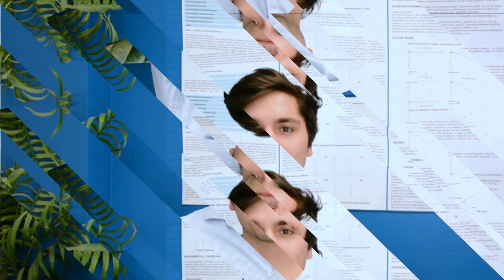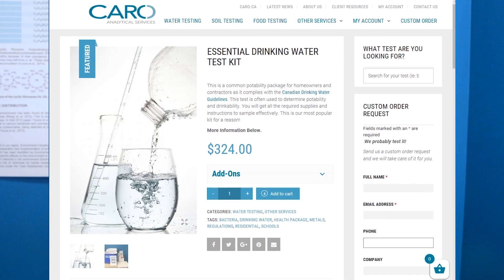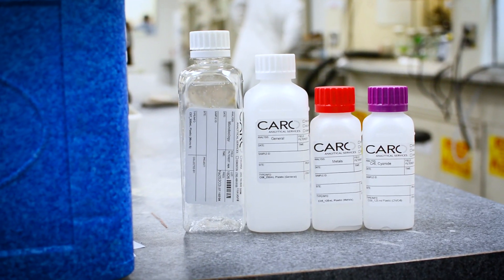Today I'm going to break down the essential drinking water test kit. You might be wondering: is this kit for me? What do I get? When will I get my results? What does it all mean? In this video I'm going to cover all of these for you.